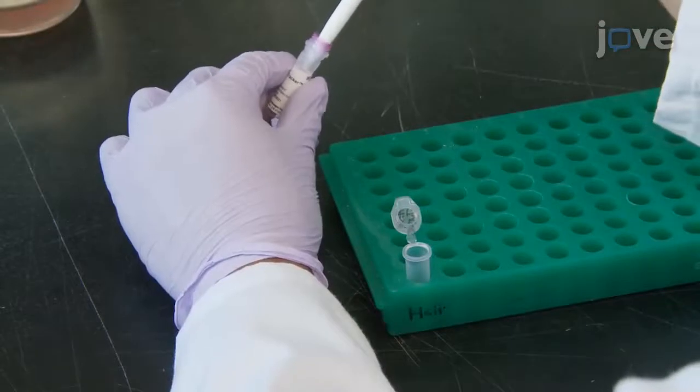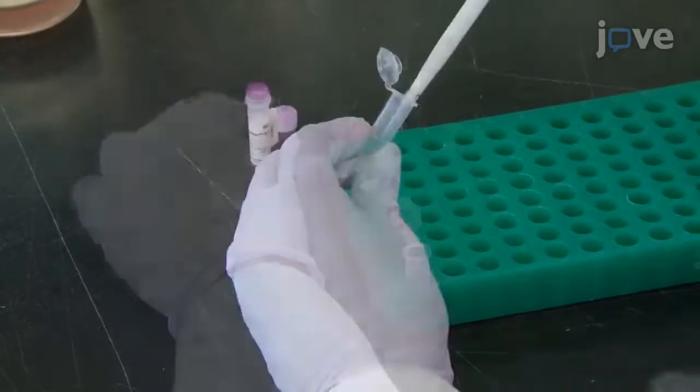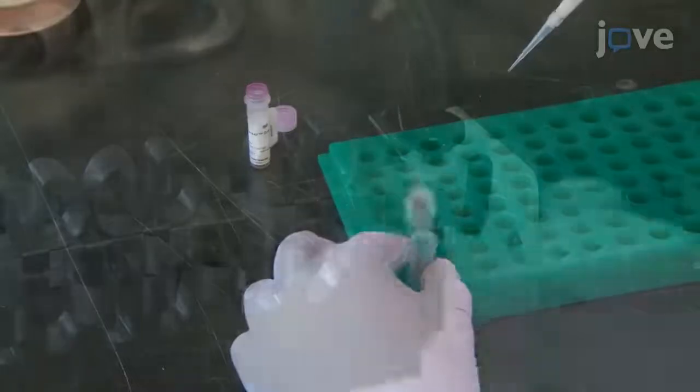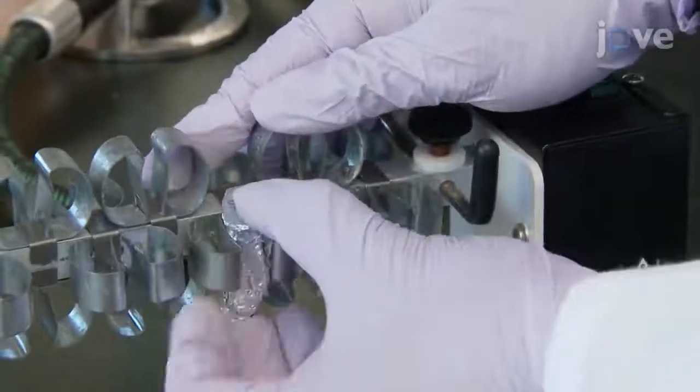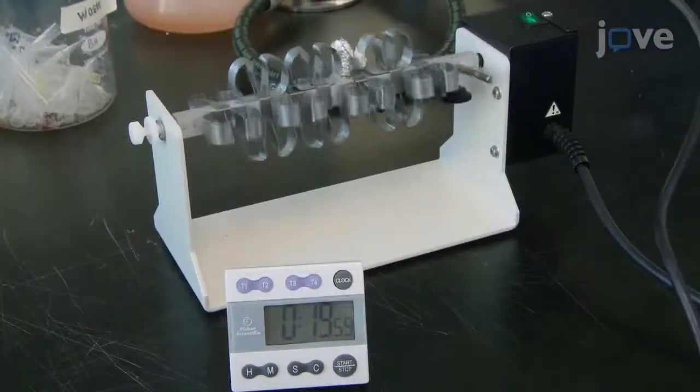Then dilute an appropriate cell tracking dye according to the manufacturer's instructions. Incubate the cell suspension at room temperature for 20 minutes in the dark.